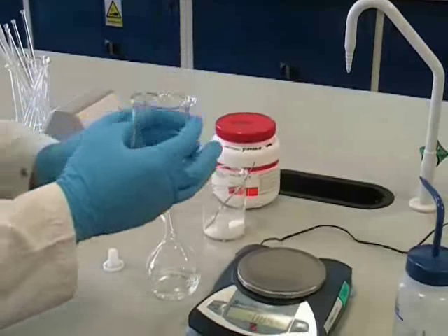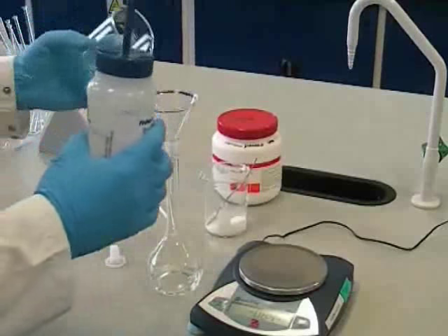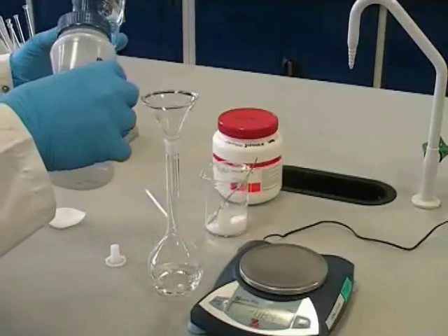Now it's vital to rinse the beaker to ensure that none of your original solution is left behind. You will be required to do this a number of times, and if you're not sure what the guidelines from your teacher are, ask how many times you should do this. In any case, it should be 2 or 3 times.